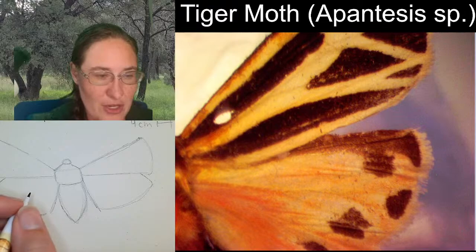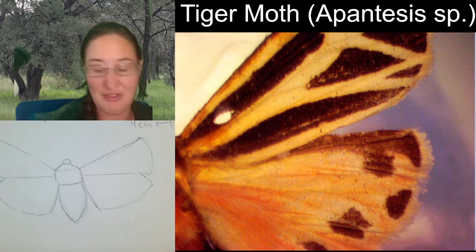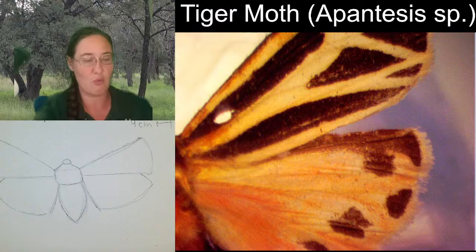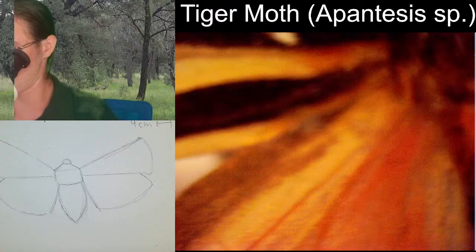When you spread the wings like this, there always seems to be a teeny tiny bit of overlap. Would it ever make sense to spread the forewings higher so you can see the upper edge of the hind wing? That is a fantastic connection to this page. Something that I always found really tricky about tiger moths is that one of the characteristics to determine that it's a tiger moth is right there where you don't get to see on the hind wing. Maybe on this side.